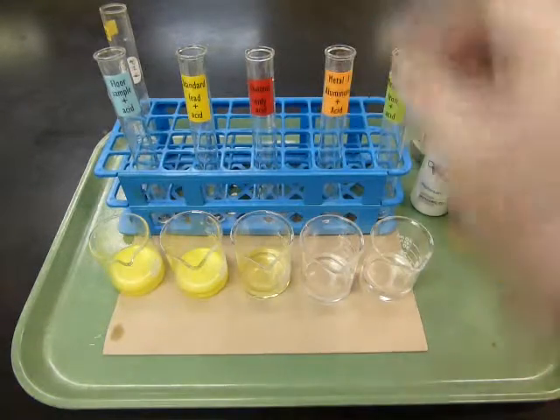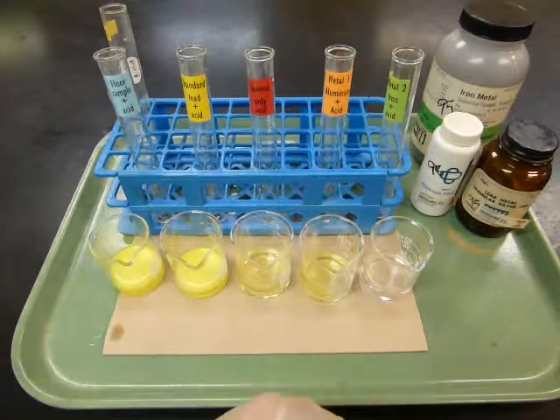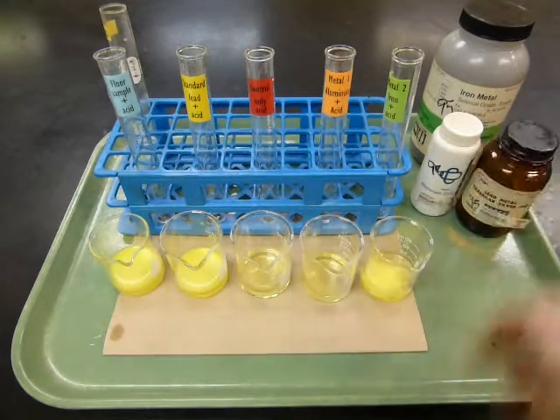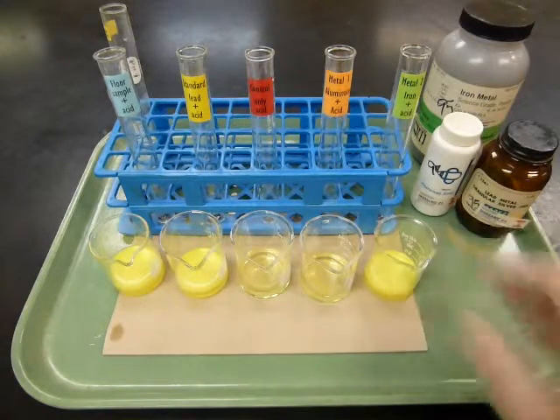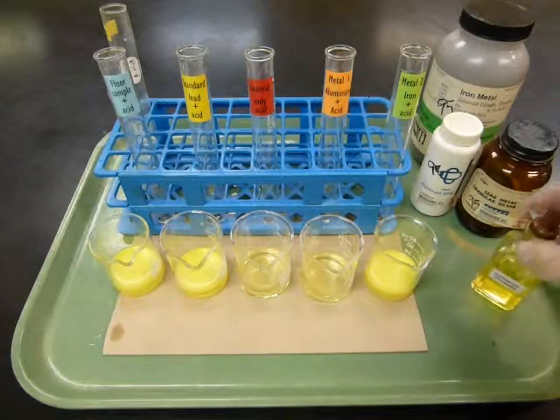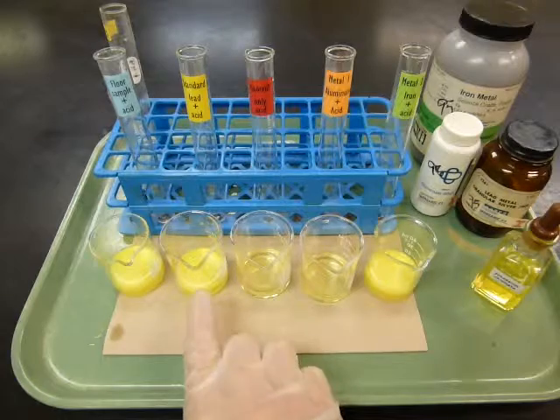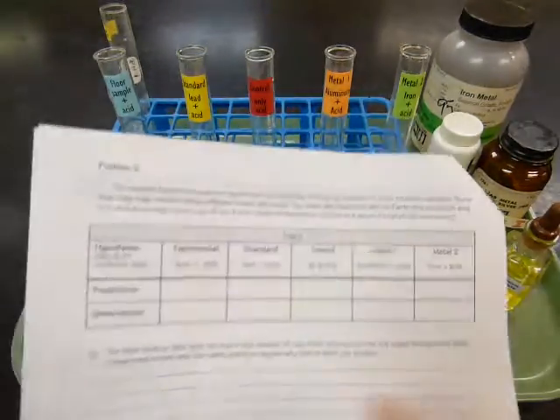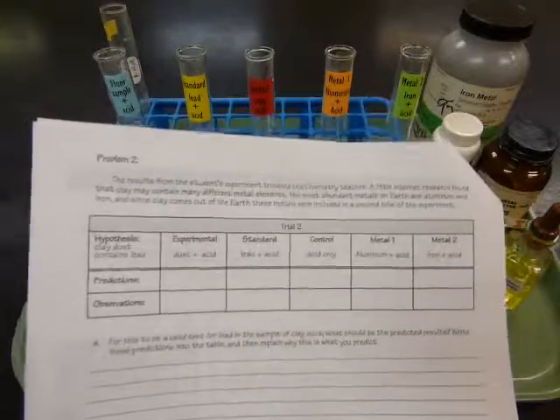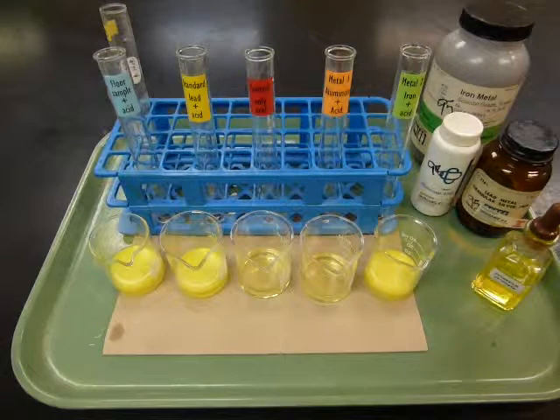And for aluminum, there's no reaction on the aluminum. And then for the iron, oh, that's interesting. So the reaction on the iron is a positive reaction, negative for aluminum, negative for the control, positive for the standard, and positive for the floor sample. So record your observations, and then you'll need to interpret these results and what they mean about the ability to detect lead in the sample that came from Mr. Kiekefer's floor.